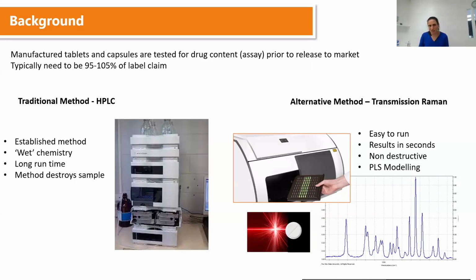It's a wet chemistry technique, so this means that you need trained analysts to be able to run it, and obviously you need a lab with the equipment and the solvents and everything else. A disadvantage of the method is that it has quite a long runtime, or it can do. So for a lot of our methods, the runtimes go overnight, and it takes a long time for us to get the results off.